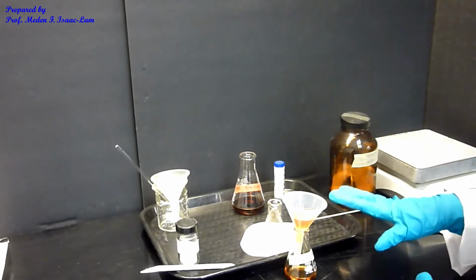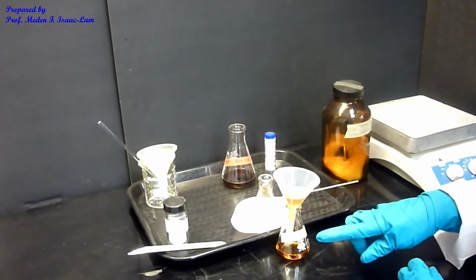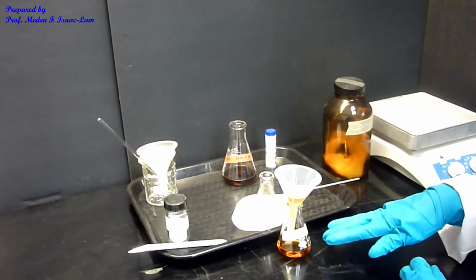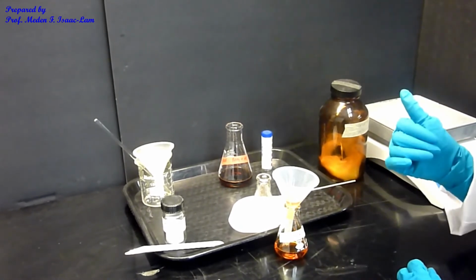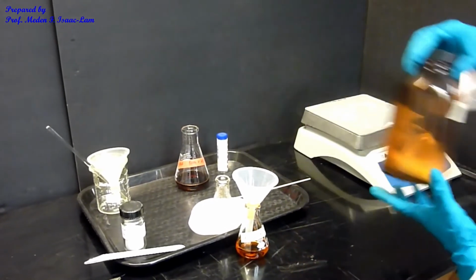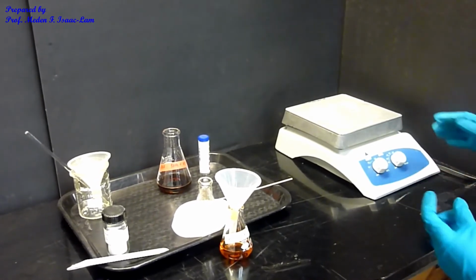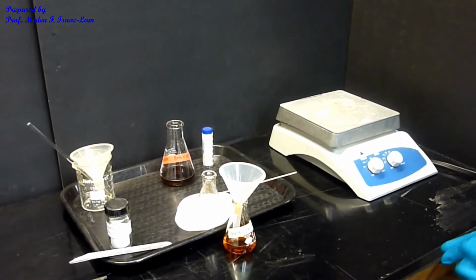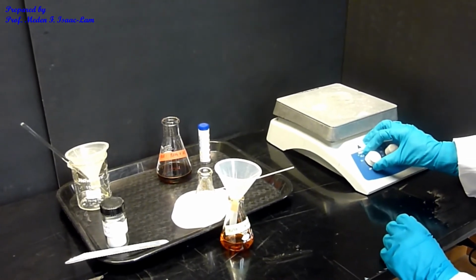So right now, at this point, I have the neutral component plus the ether, the solvent. So I want to remove the ether by just boiling it. I'm going to boil it off, and I will get rid of the ether. The boiling point of ether is very low. It's almost just a little bit above room temperature. So I'm going to set it to just slightly above 30, okay?